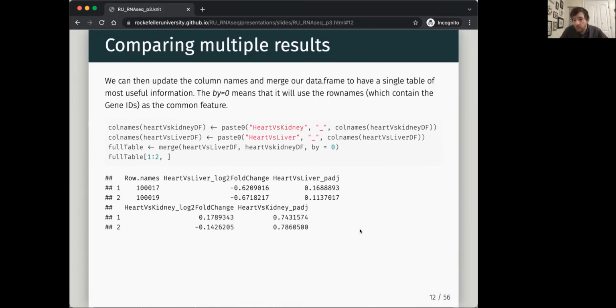As a convention, in our group we use gene IDs because they're a bit more robust. They're less subject to issues with capitalization or not capitalized, or whether there's things like hyphens, especially when you look at multiple different species. Sometimes there's a much more complex nomenclature involved for symbols.